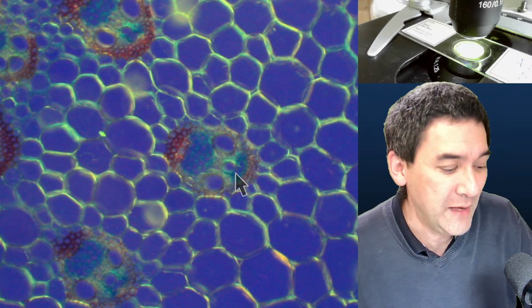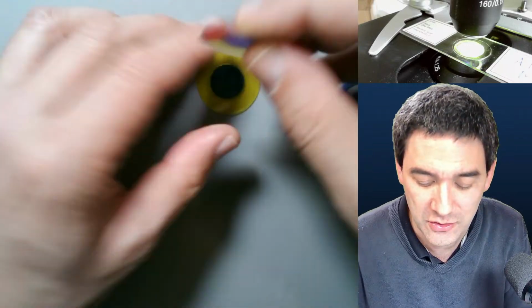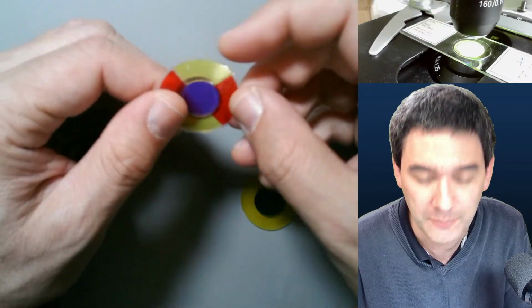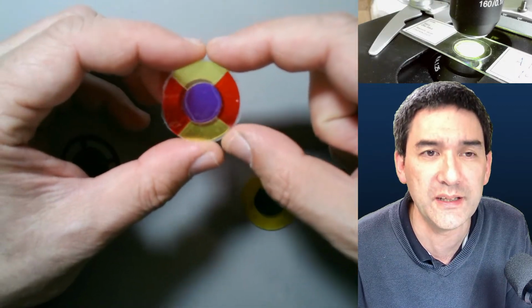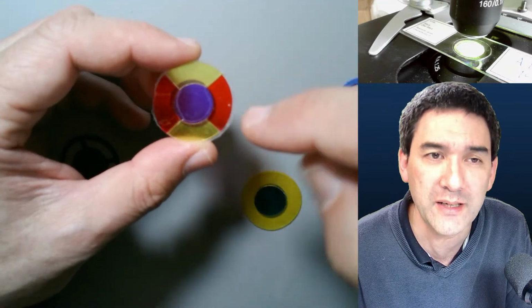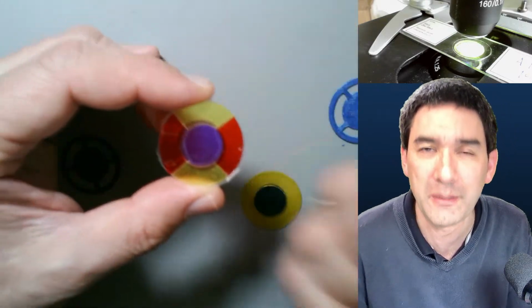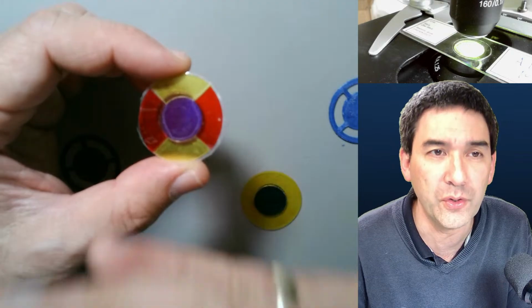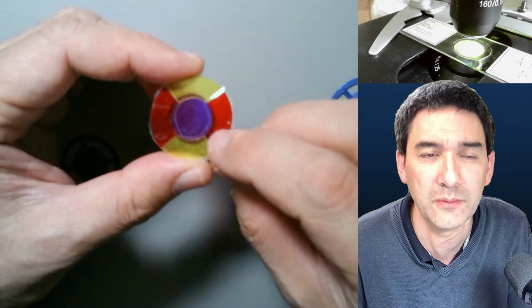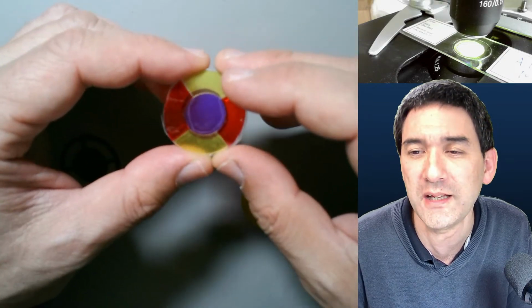What I have read, however, but I have not found an ideal specimen yet, is to use filters like this, because you see over here it's red, red, and yellow, yellow, and blue in the center. What I heard is that they will create images depending on how the specimen refracts or reflects the light, with red in one direction, yellow in the other direction, and blue in the background. So if there are, for example, certain repeating patterns, apparently those are also suitable. But I've not found a sufficiently good specimen yet.